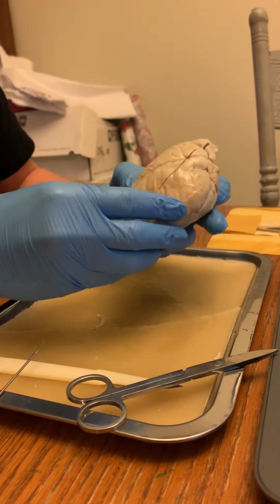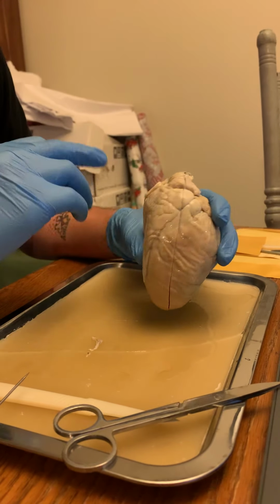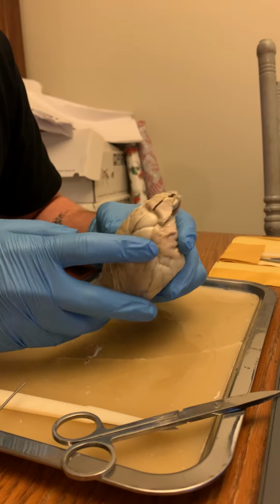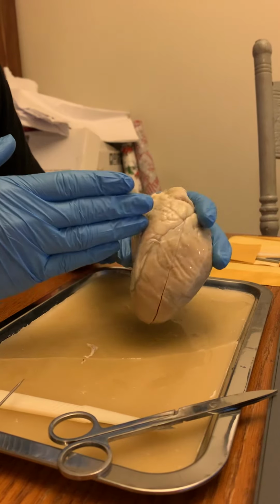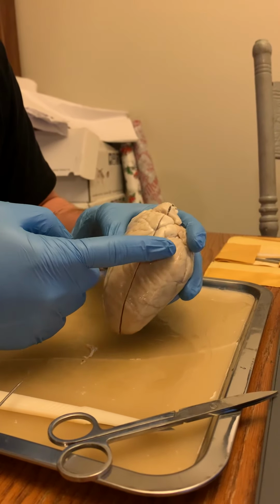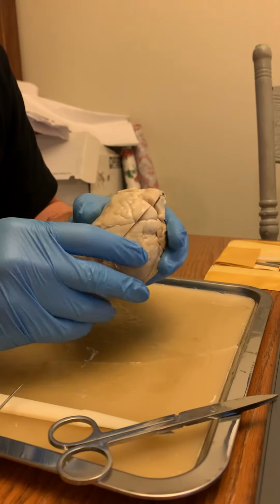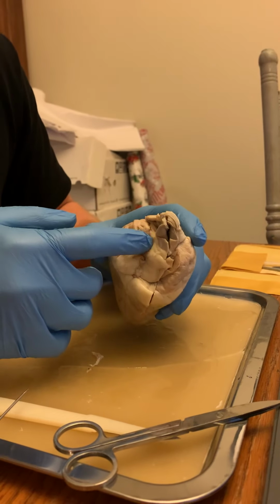The right auricle, if you look at it from this side, is up on the top right here. The left auricle is right here. The right ventricle is on the same side. It's the darker section, as you can see. The left ventricle is the bigger, darker section over here. And the pulmonary trunk runs right through here.